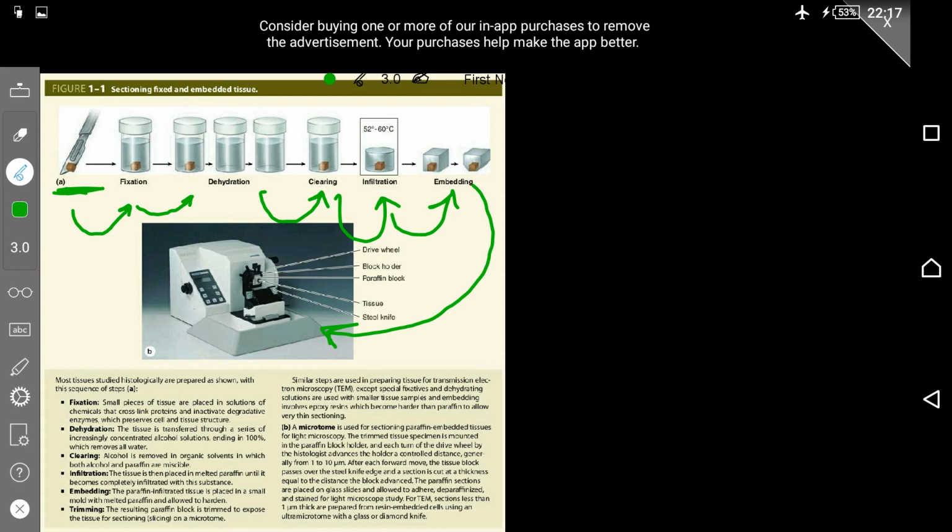This is the image of a microtome in here, you can see, and this microtome helps the technician that works on it to be able to precisely cut the block of the paraffin infiltrated tissue into thin slices that can be very readily and easily studied through a microscope.